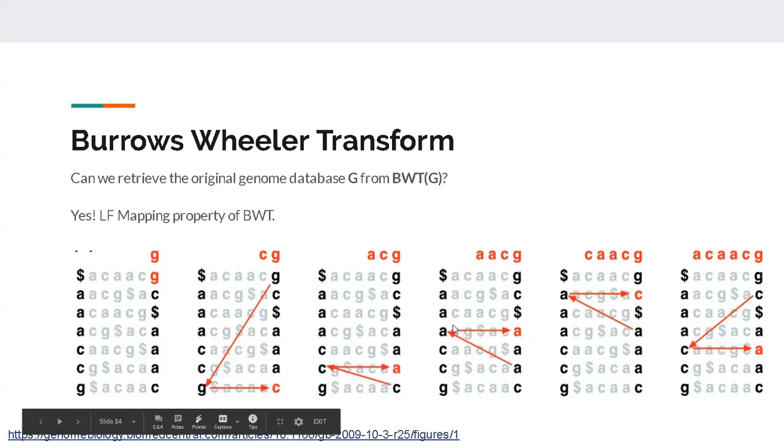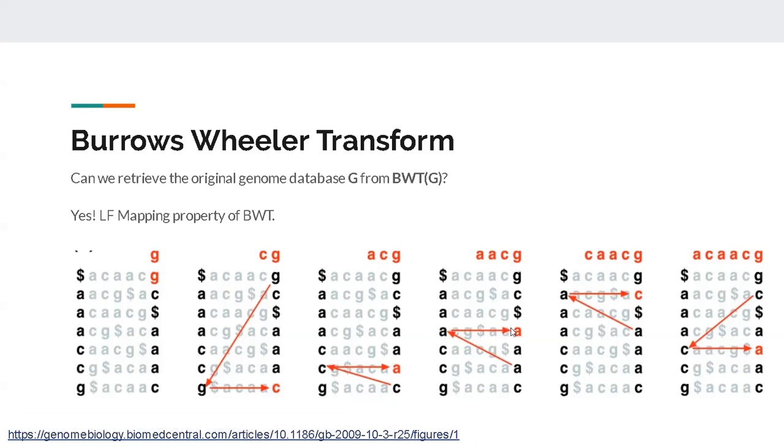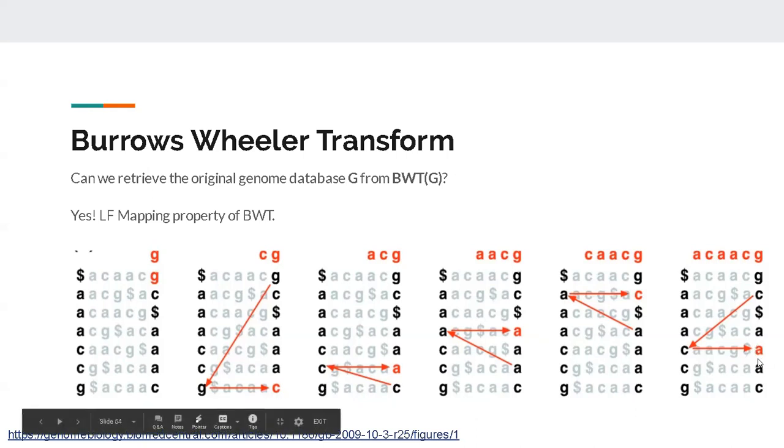So we will move to rank 3 in the first column and go back, look at what was there before this A, and we will keep repeating this exercise till the end. Now, how do we know that we have to end at this A? Remember that you are going blindly, so you don't know where to end.